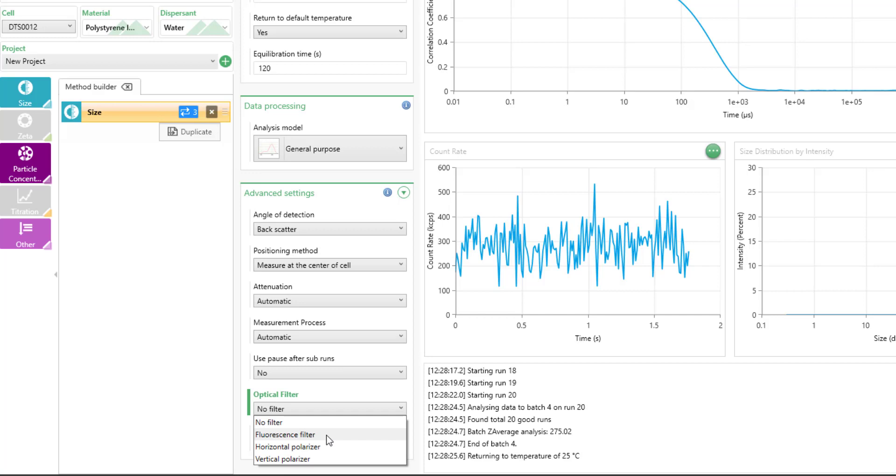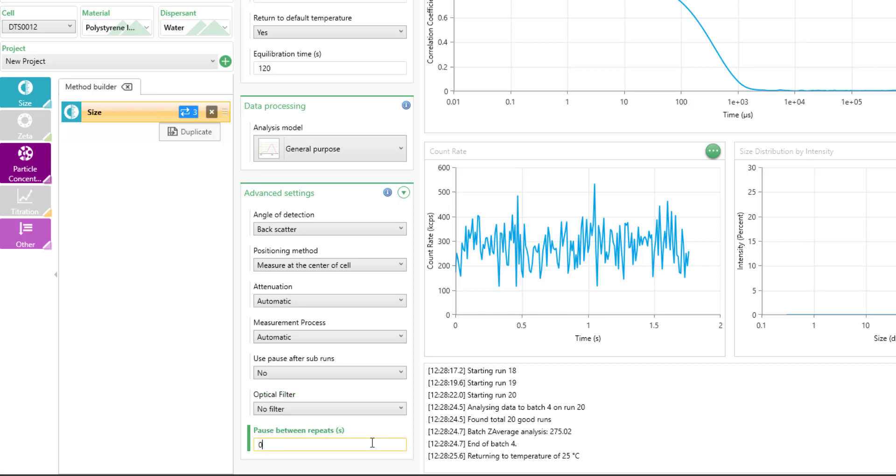The fluorescence filter would be used for samples that might absorb in the wavelength near the wavelength of the instrument. The polarizers might be used for identifying multiple scattering effects and eliminating them or for non-spherical particles. You can also choose to put a pause in between repeat measurements if you would like a little pause between your triplicate runs.